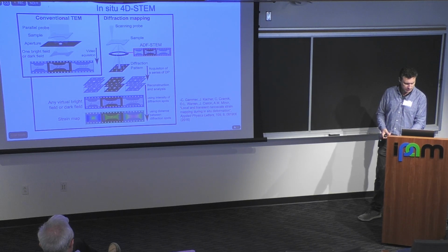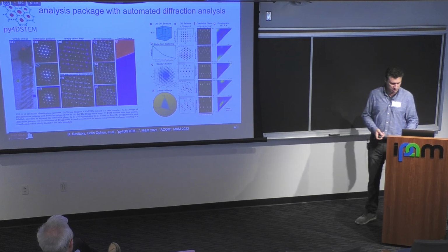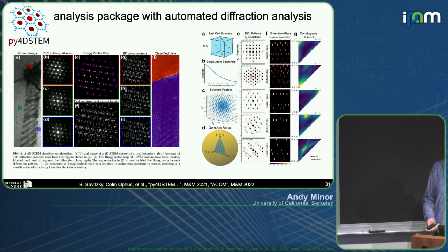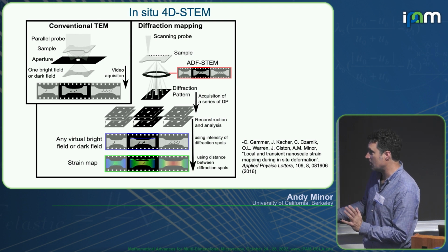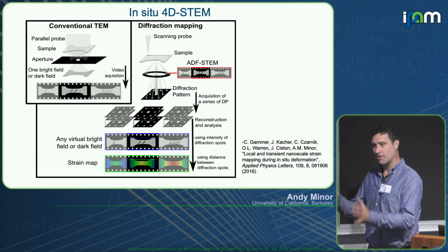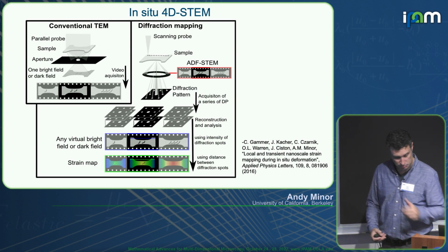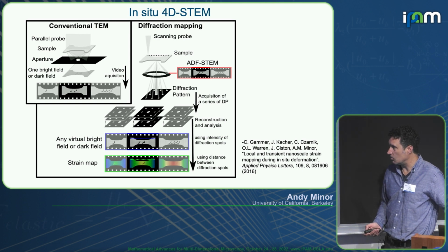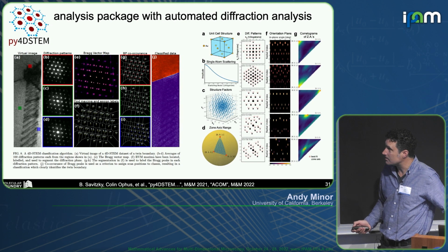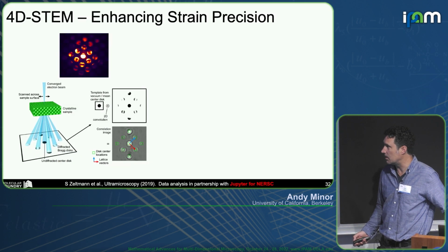this test. I first want to mention, well, Colin mentioned this yesterday, so I'm not going to go into detail, but let me go back up. These experiments are complicated. There's a ton of data. You don't get to pick your diffraction condition and the tilt and all this stuff, so it's quite messy. And so it's really only with these tools that Colin and his group have developed recently that we can do this. For instance, the automated analysis with py4DSTEM. If you didn't have this package, you really couldn't analyze these huge amounts of data.